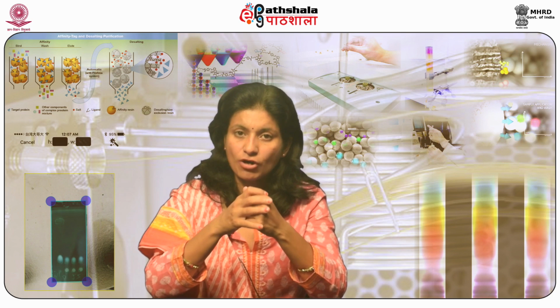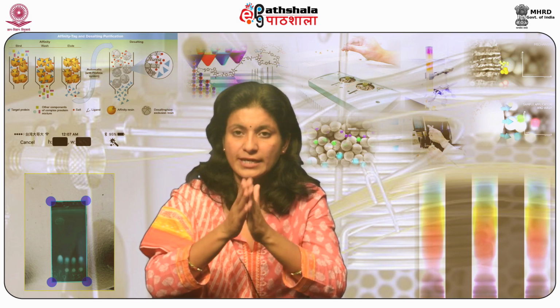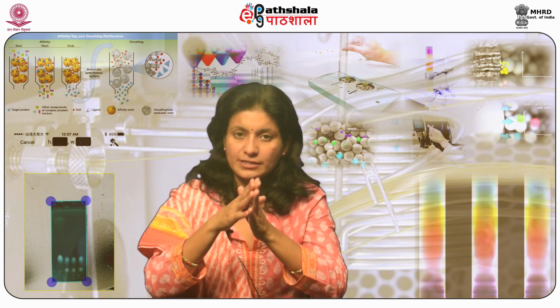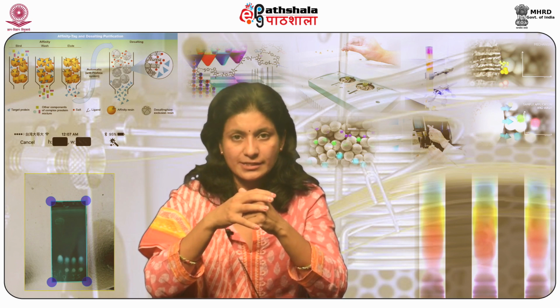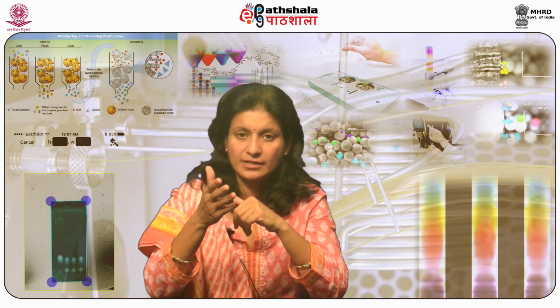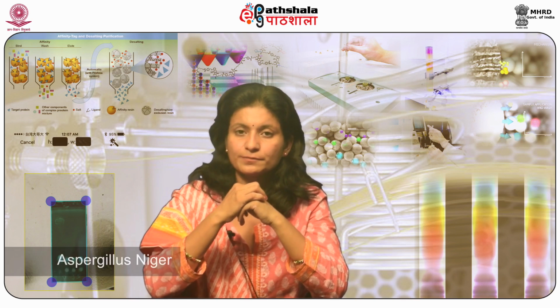The applications of IEC are as stated under. The cation exchange column is utilized to segregate thiamine from riboflavin. IEC is broadly used for the separation of biological large molecules like proteins, polysaccharides, etc. It has the potentiality to extract and isolate mycotoxins produced by fungi, for example, Aspergillus niger.